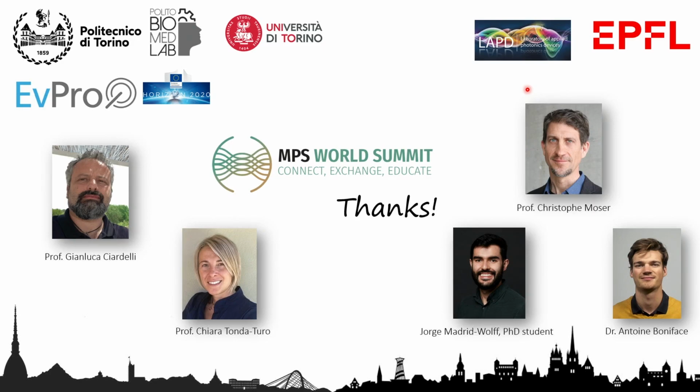Hello, thank you very much for your talk. I was wondering if in the future it would be possible to substitute GelMA with a more elaborate matrix, because pancreatic cancer is known for a lot of presence of collagens and hyaluronan, which are actively participating in the activation of stellate cells as well. Yeah, thank you for this great question.